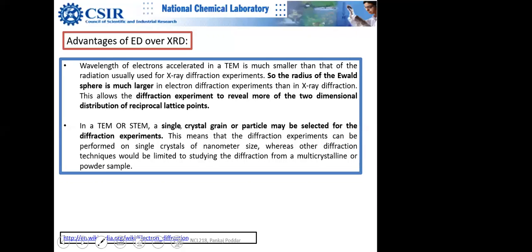Sir, you told about the secondary electrons which are generated after the transmission of that sample, means scanning of that sample. Sir, what are those secondary electrons? How can they be generated and how can we amplify them? Okay. Good question. So remind me in the last 15 minutes.